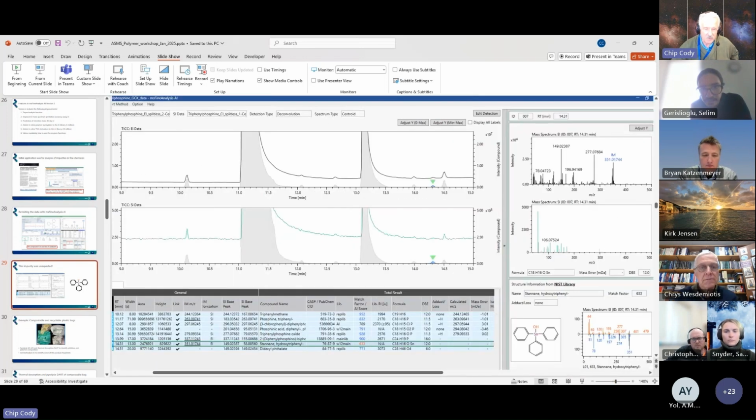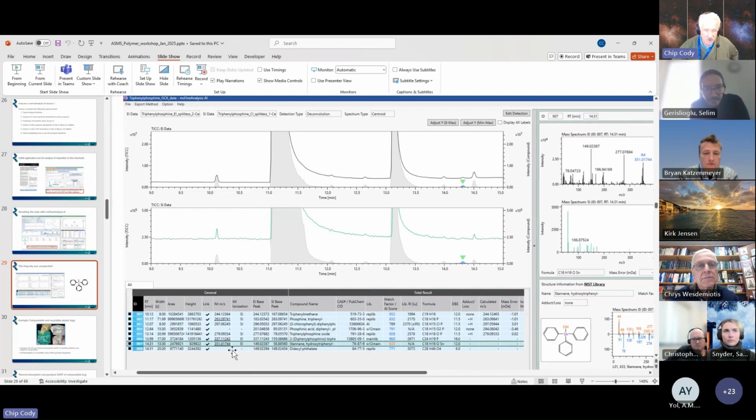This is the main tab. It's the summary of all of the compounds identified, and of course, this one was easy. Everything was identified with high confidence, so they're all color-coded in blue. But for each of these, we have an EI database match. We have an elemental composition based either on a molecular ion from soft ionization or in the EI spectra, or a protonated molecule.